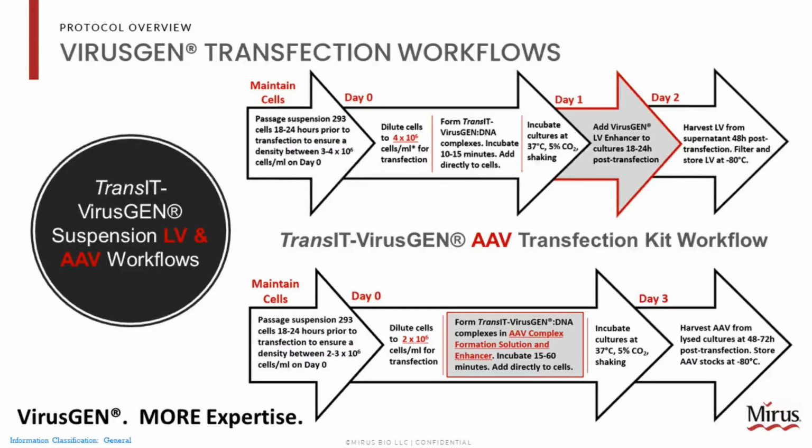This is a standard workflow for VirusGEN, be it for an AAV or lentivirus manufacturing process. This process can work from a well plate to 1,000-liter plus manufacturing. Of note, we highlight some of the key parameters around transfection: cell density, cell viability, complex formation time and methodology, and ideal harvest time. We will need to keep these factors in the back of our head as we develop and scale our viral vector process.